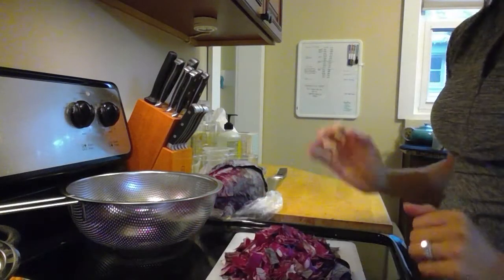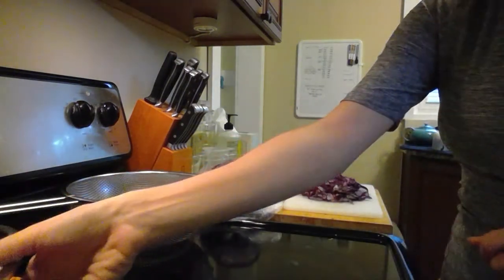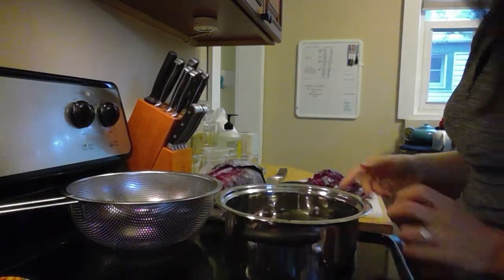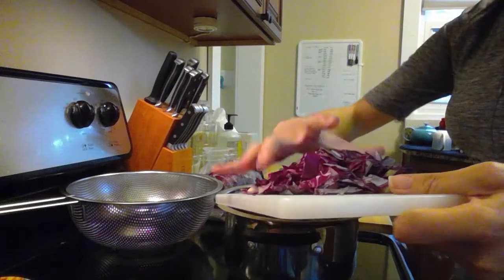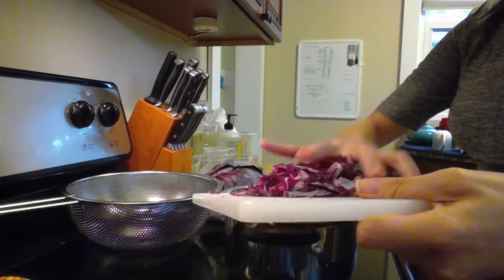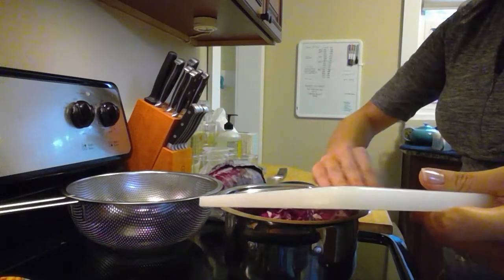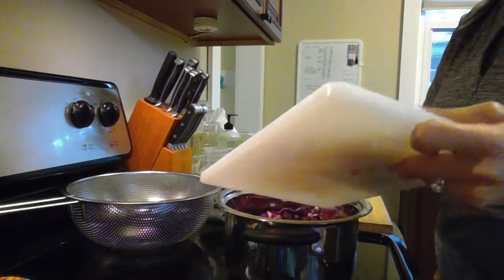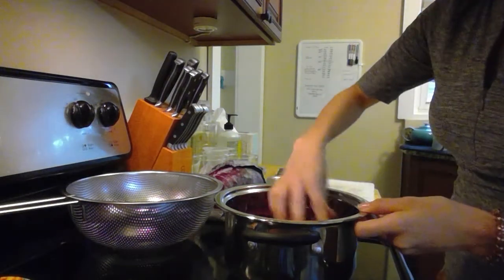Now, once you do that, you're going to put this inside of your pot and you're just barely going to cover it with water. You don't want to put in too much water because then it would be too dilute. Thinking about our molarity, right? We'd end up having a lower molarity solution. So make sure that you just cover it with water. And make sure you have a large enough pot to do so.